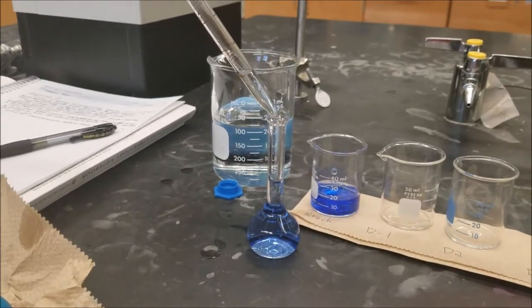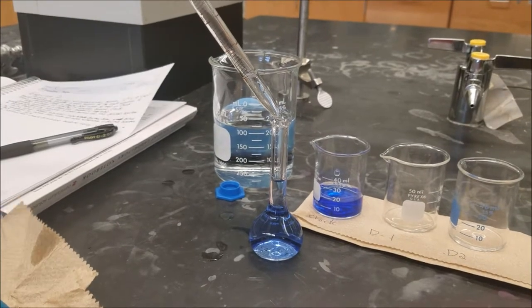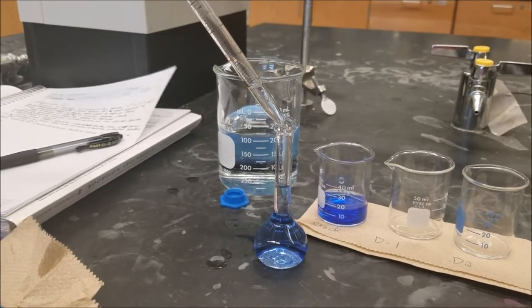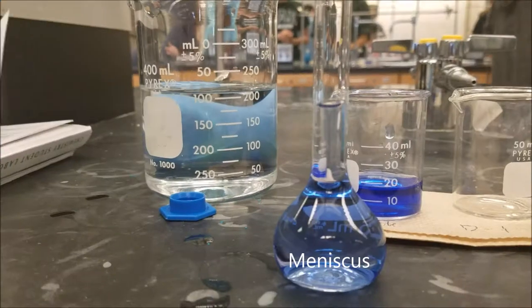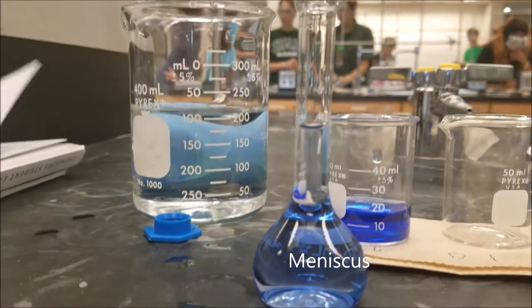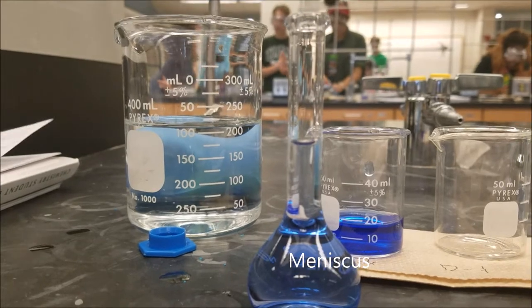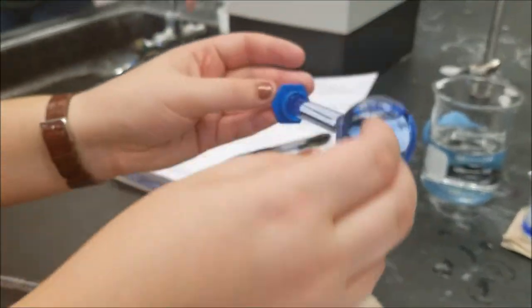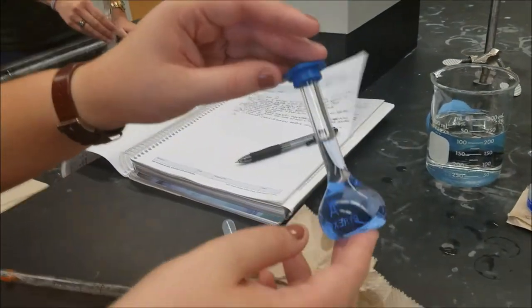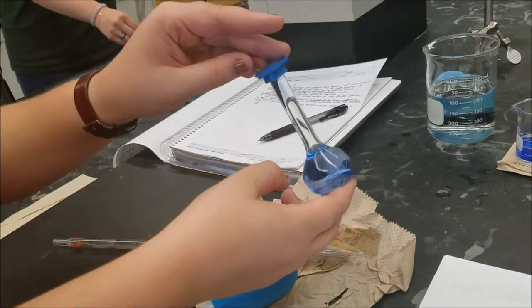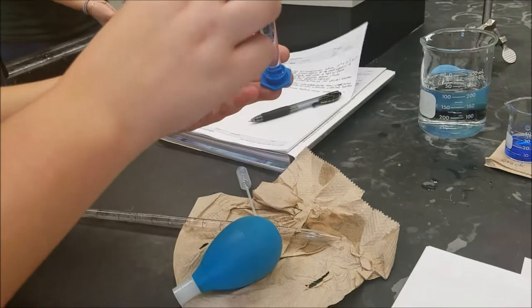Since you repeat this procedure for each dilution, the final volume will always be 25 mL. Next, put the cap on the flask and mix the solution with the water. Pour this dilution into a clean beaker. You will repeat this procedure for each dilution.